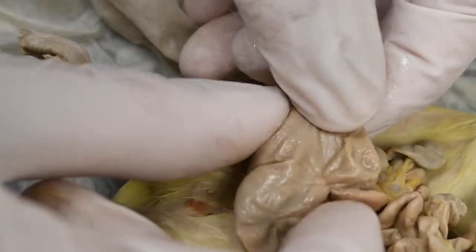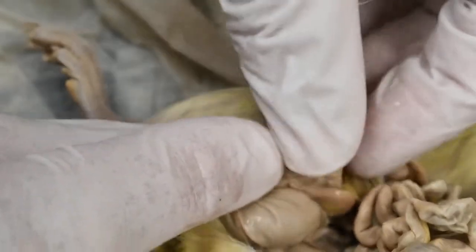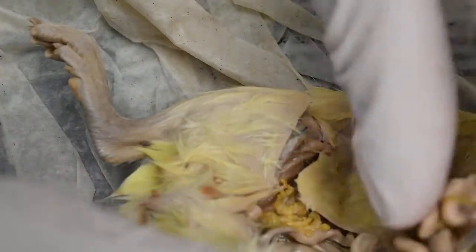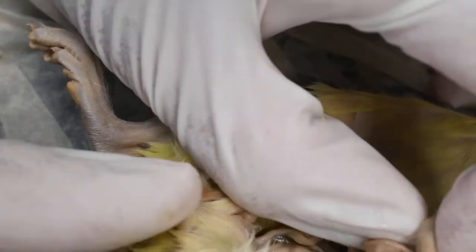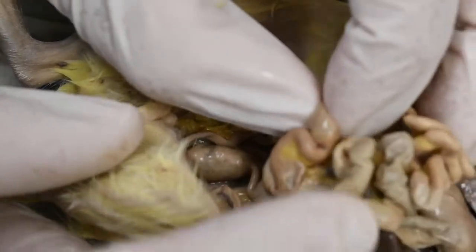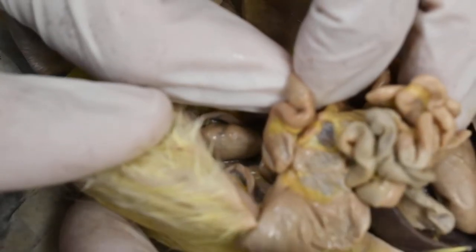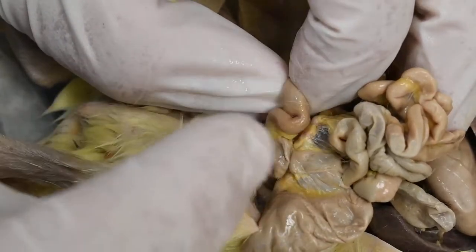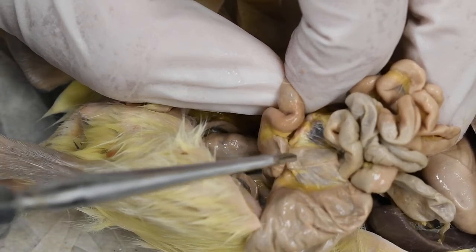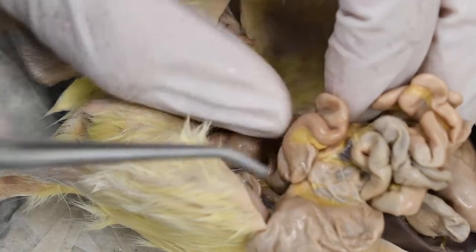That's the cecum. So coming into the cecum, coming into the large intestine, you have a branch, or you have the ileum, and then going off in the other direction, there's also part of the large intestine. Now, this gets difficult to see unless you cut all these mesenteries, which I'm not doing in this illustration, but I have a picture in the Practice Practical that shows you a rat with all the mesenteries removed. But coming in here somewhere, we have the ileum, and there's an ileocecal valve, kind of like the pylorus, connecting the ileum to the large intestine.